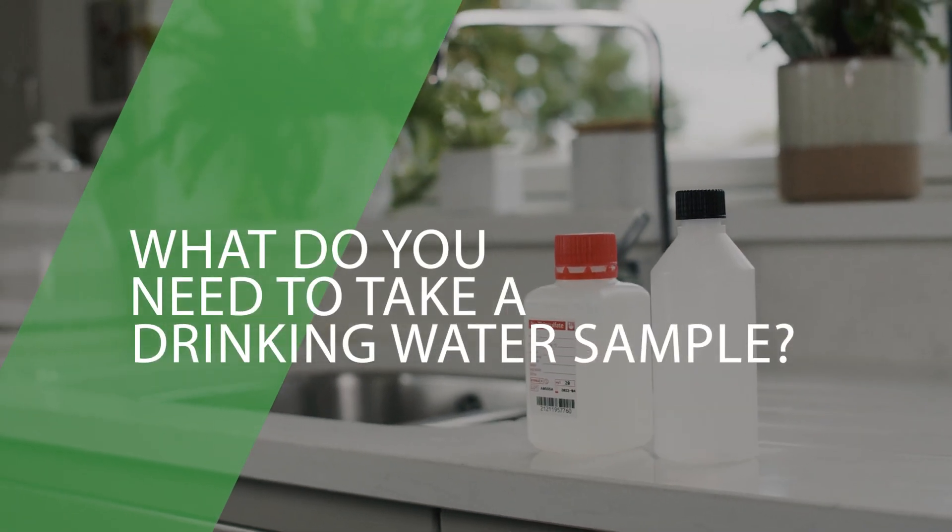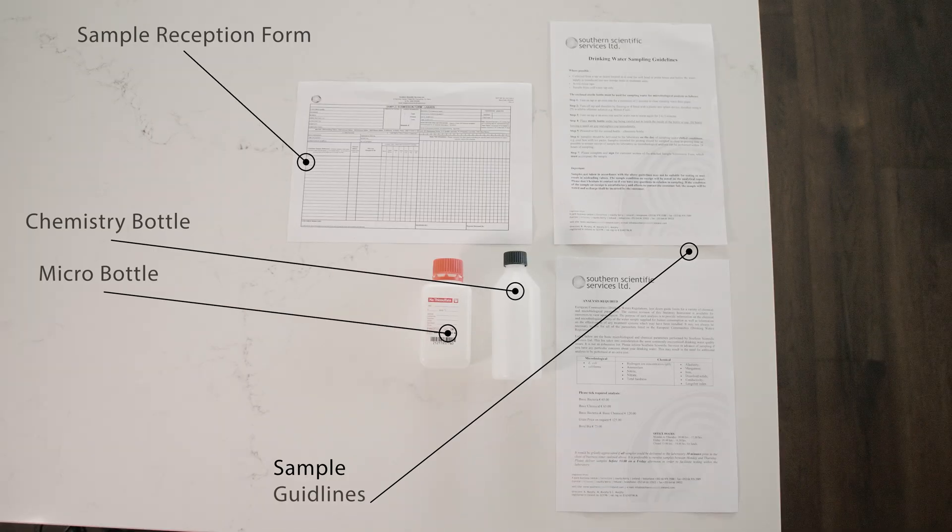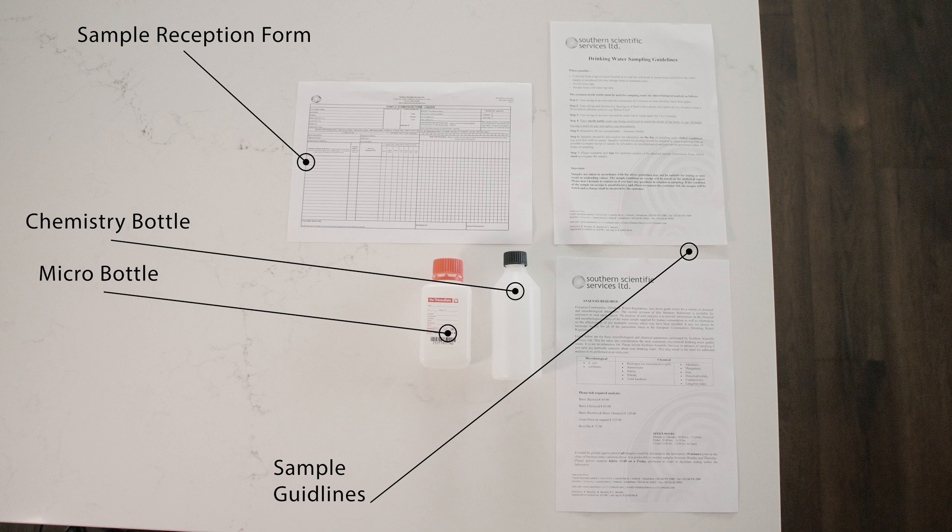What do you need to take your drinking water sample? The standard drinking water test kit that you have received with your order will include everything you need to take your drinking water sample.